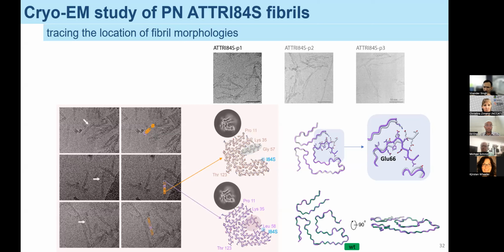As you see, there are multiple layers, which could be this closed conformation or this open conformation. We could only observe this conformation when we changed our strategy and isolated each layer, and could find this hidden class from the closed conformation.